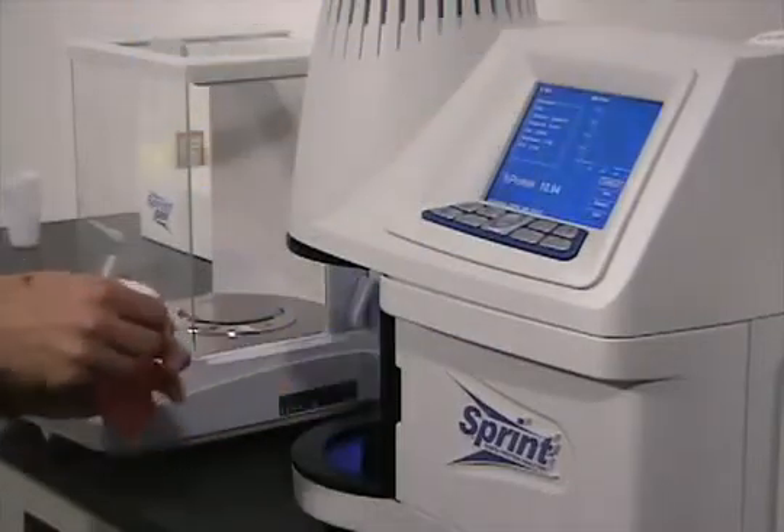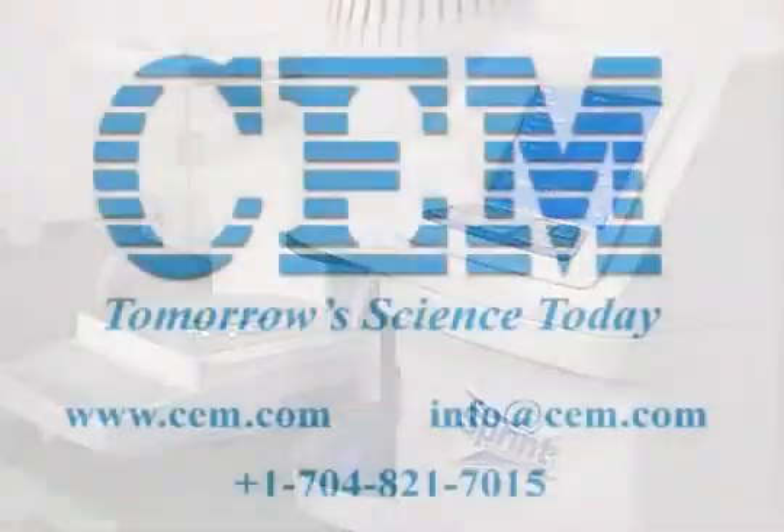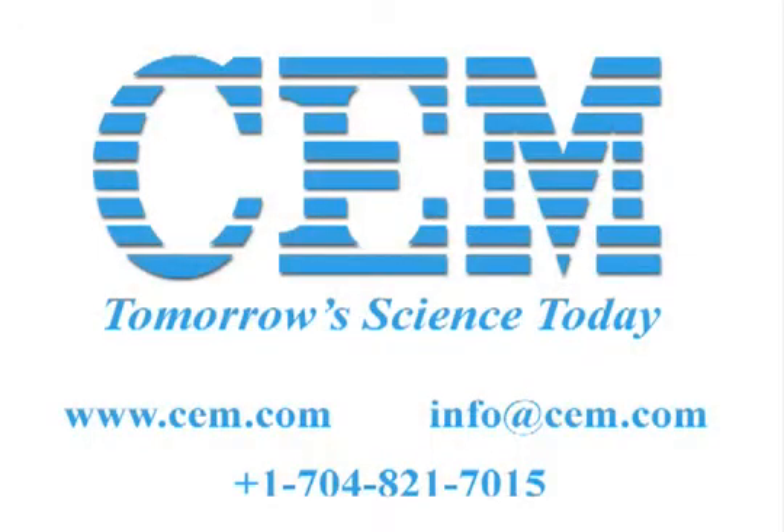Sprint comes pre-loaded with a broad selection of methods ready to analyze your samples. For over 30 years, CEM has provided customers throughout the world with innovative products for the production control of their food processes. Sprint is our most advanced product ever, truly a breakthrough for protein testing.